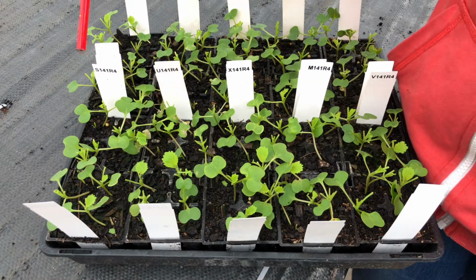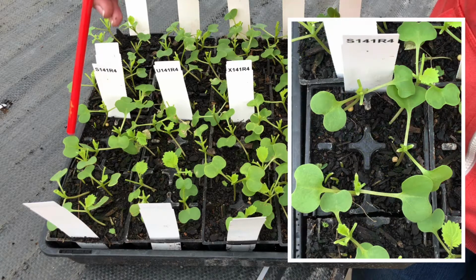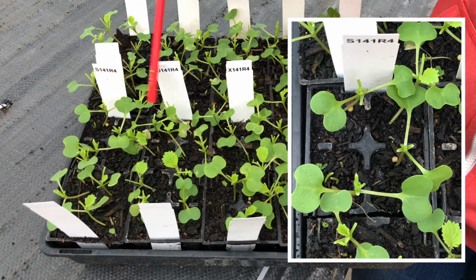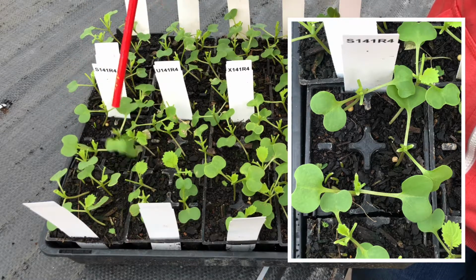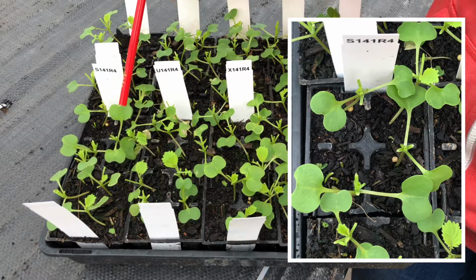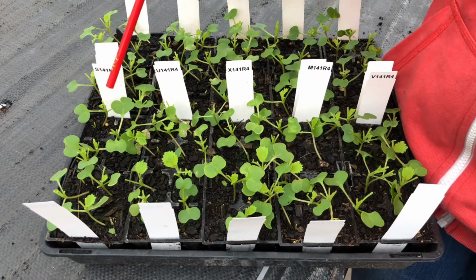We then have an example of an effective fungicide here. This is our Soltro, which is an SDHI fungicide, and you can see even when it's right beside your untreated control, you've got no disease whatsoever. All of the cotyledons are completely clean, green and healthy. So we've got no resistance to these SDHI fungicides.